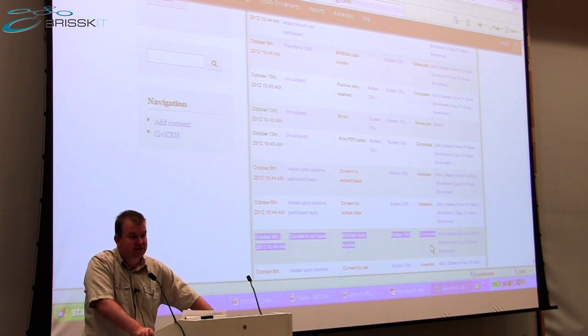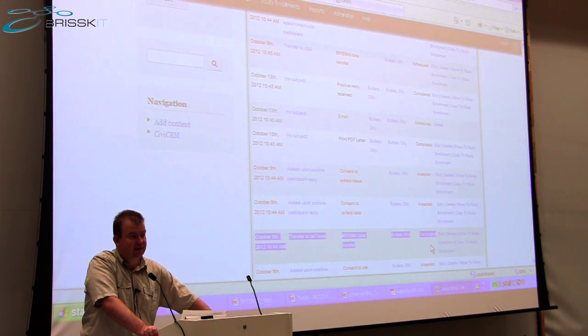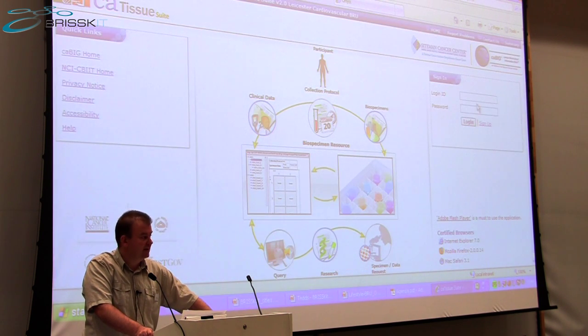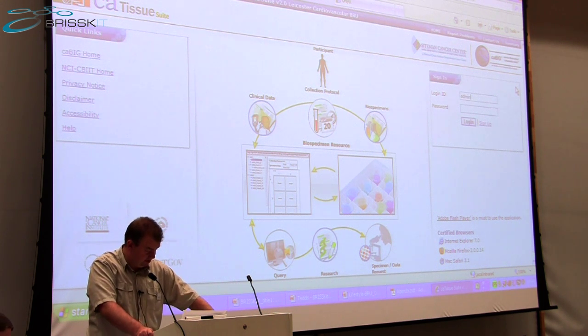There's a similar process for transferring the patient identity into Onyx for creating an interview, and also into I2B2 for creating the kind of endpoint data store to involve the patient in the cohort discovery process within the project. But to start with, we'll switch over to CA tissue, and you can see the patient being populated into CA tissue once Olly's logged into it.